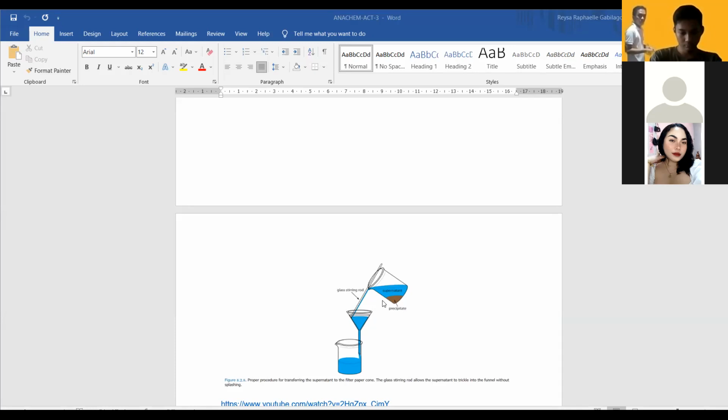So this sa pagsaing class, we just don't do the filtration. Okay, diretso na nato iabo ang ato ang liquid portion. Minsan may nasasama pang rice pag hindi maayos yung decantation. Pero ito sa laboratory, so ipapadaan talaga natin siya sa funnel with a fitted na filter paper para just in case na we need to really obtain the precipitate, hindi siya mahahalo doon sa filtrate. By the way, itong liquid na ito na nakuha natin during the filtration process is called the filtrate. Okay, filtrate ito ha, and then yung maiiwan, precipitate.